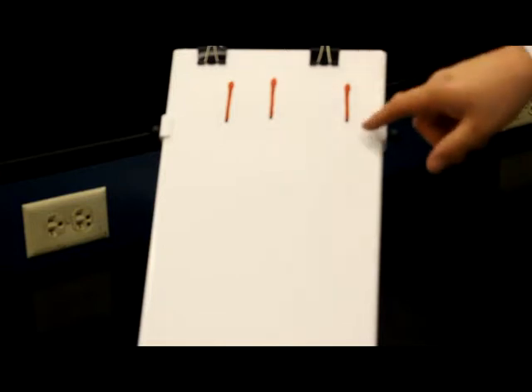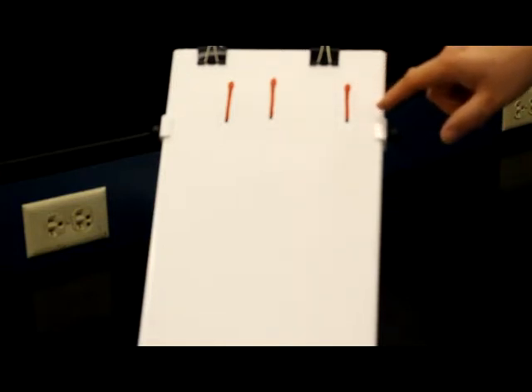Now on this paper, this blood actually soaks in quite heavily. On the paper you're using, which actually has a smooth surface that's a little glossy, it's going to take a lot longer to dry. But if you can see here, this droplet has proceeded down the length of the paper and is still quite heavy and wet here, as you can tell. You're going to want to wait for that to dry. And so this is going to need to sit for at least 10 to 15 minutes until it dries completely. And then you'll be able to use and work with this photo and package it correctly.